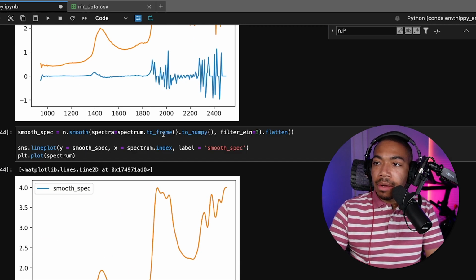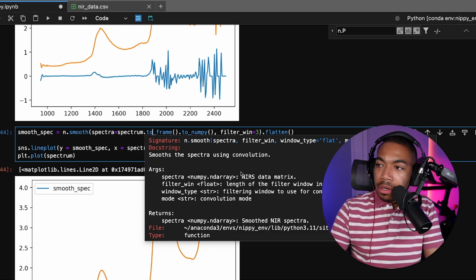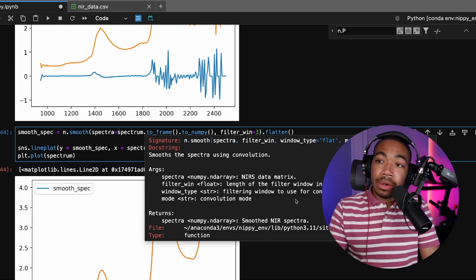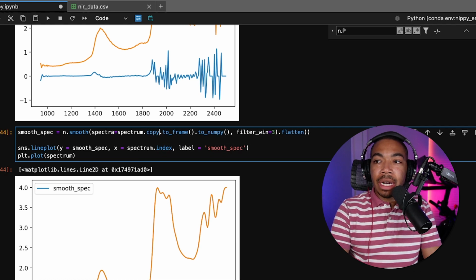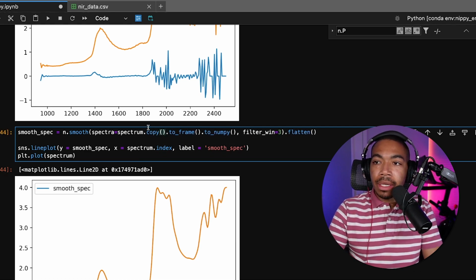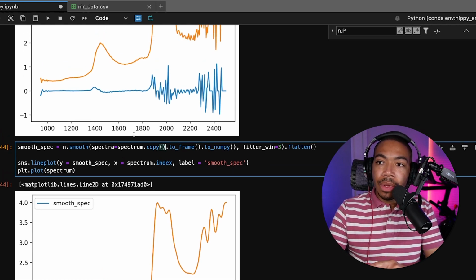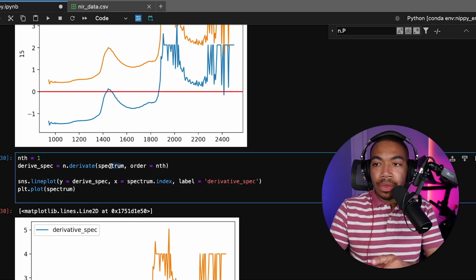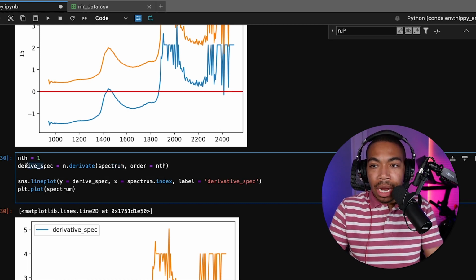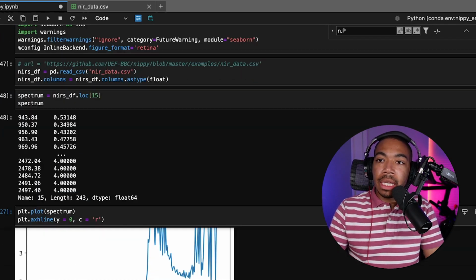So I made a mistake, and this is again where documentation matters. It appears, unless I've done something wrong, that it actually updated our data here. What I should have done, and I now have to rerun everything, is used a copy just to make sure I don't impact the original spectrum data. With all the previous methods it had not impacted it, so it was fine just running the method on this array. It returns a copy and I can save that copy as whatever. That is not the case in this method. So let me rerun this and test that theory.